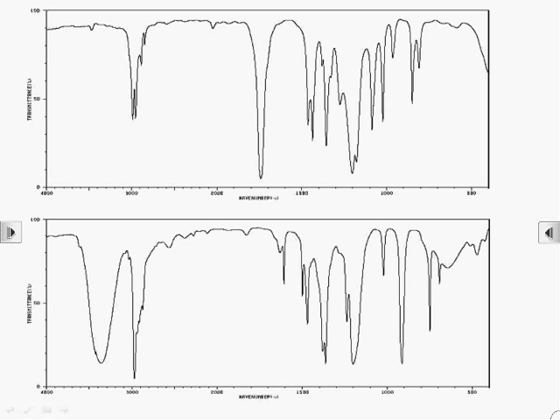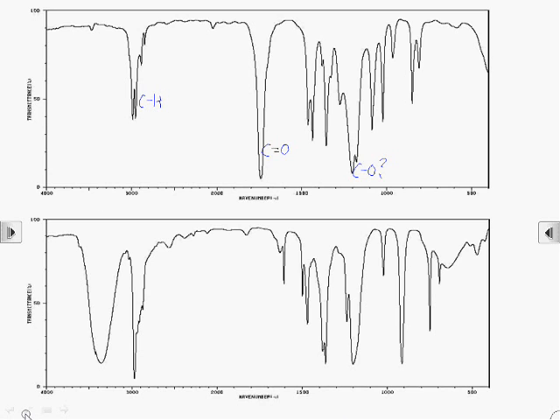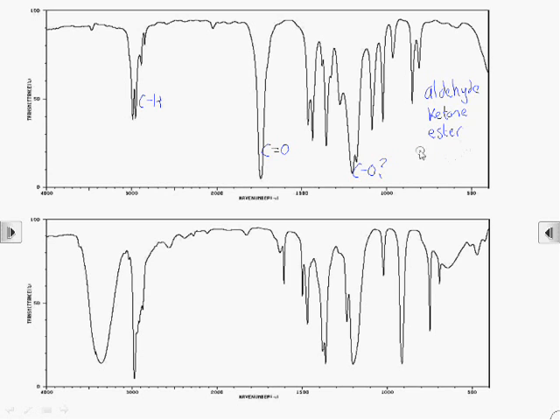The infrared spectrum tells us about what functional groups are present in a molecule. Here's a carbonyl peak at 1750 wavenumbers, and here may be a carbon-to-oxygen single bond. We're identifying these using the wavenumber regions given on our datasheet. Around 3,000 wavenumbers corresponds to a carbon-to-hydrogen stretching vibration. So we can identify this molecule as being possibly an aldehyde or a ketone, or it might be an ester, a carboxylic acid, or an amide.